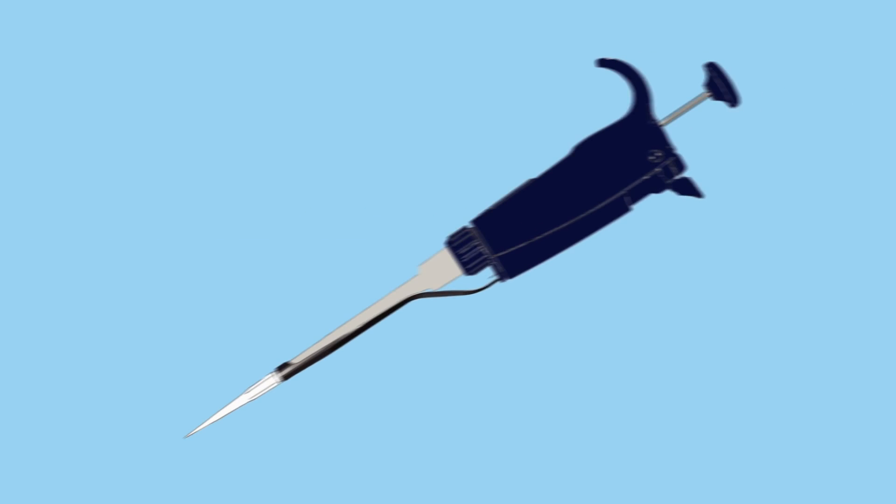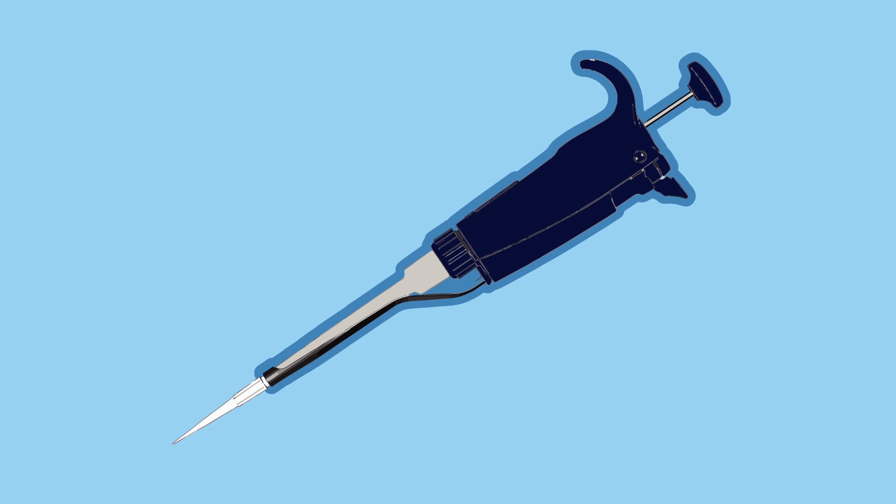Barrier, often called filter tips, serve two purposes. To protect your pipette from aerosols created when fluids are aspirated into the pipette tip, and to protect the pipette from contamination and or damage from over-pipetting.